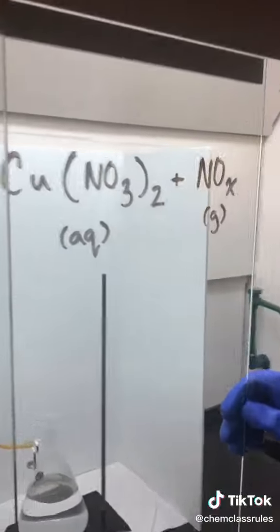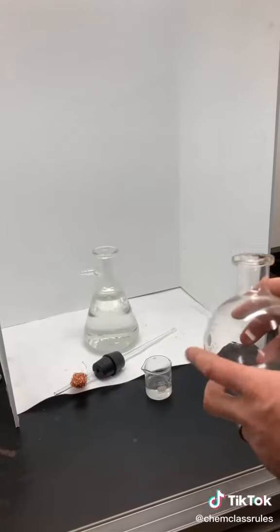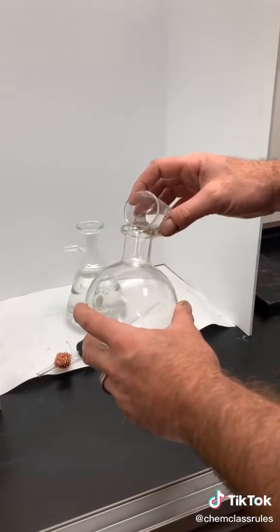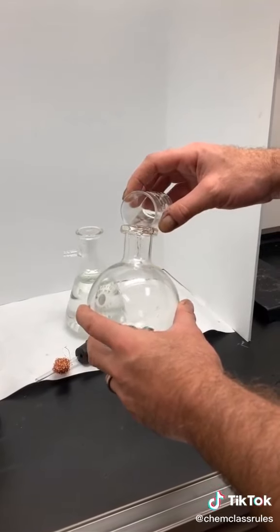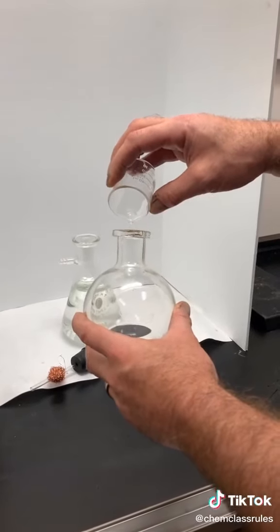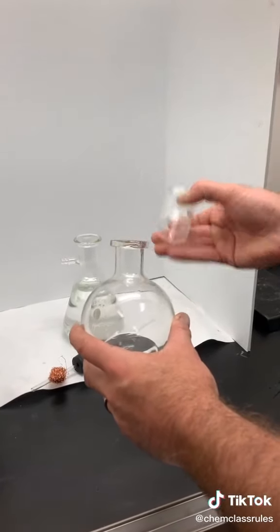species generated. To begin, we've mostly filled a vacuum flask with water and made ready our copper wire, glass tube, and stopper setup. So into our round bottom flask goes around 15 milliliters of concentrated nitric acid. Next, we will very gently stopper the flask with the setup that was mentioned earlier.